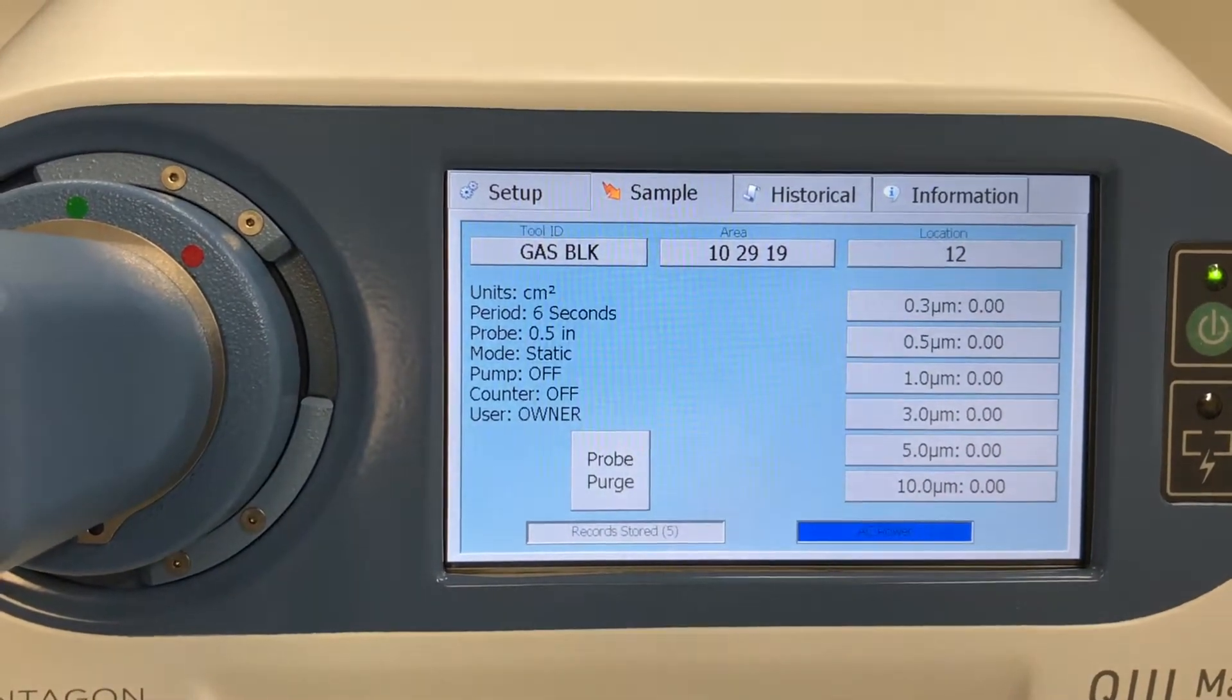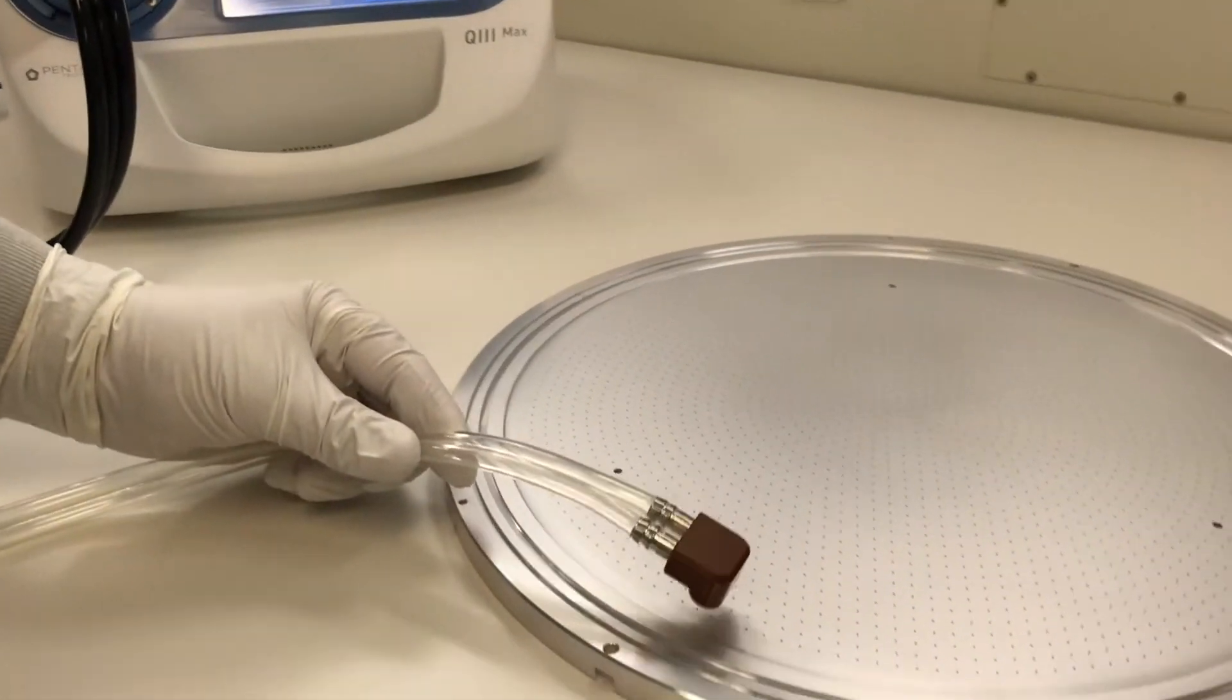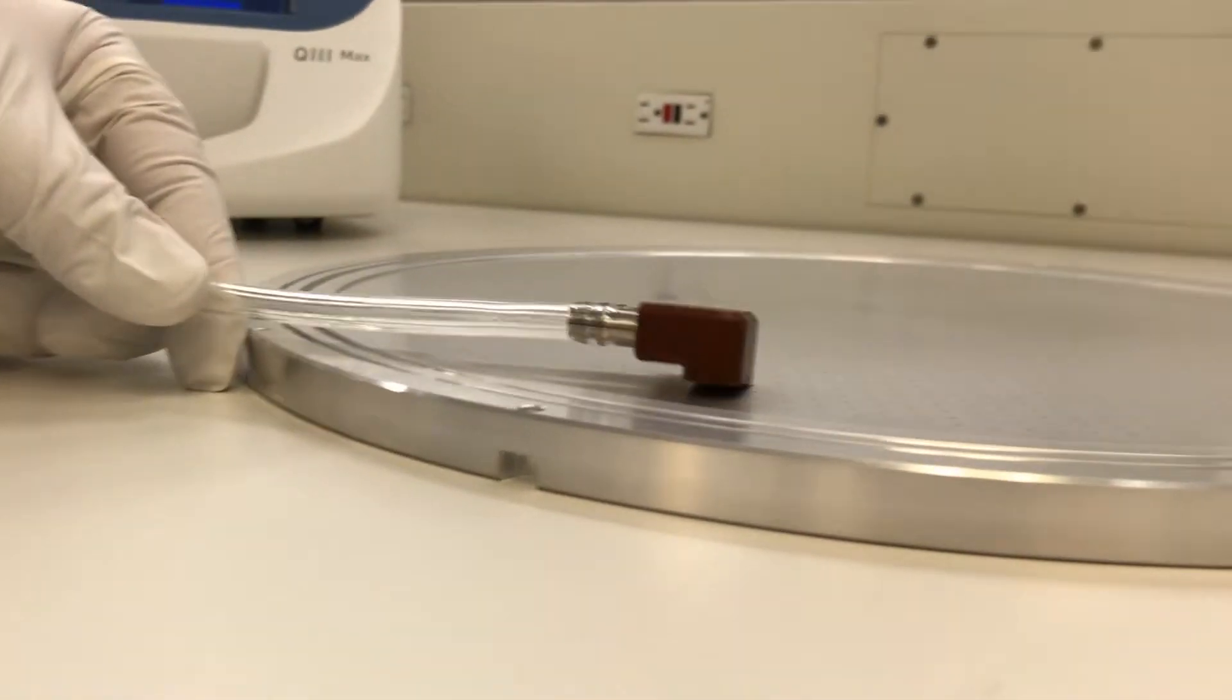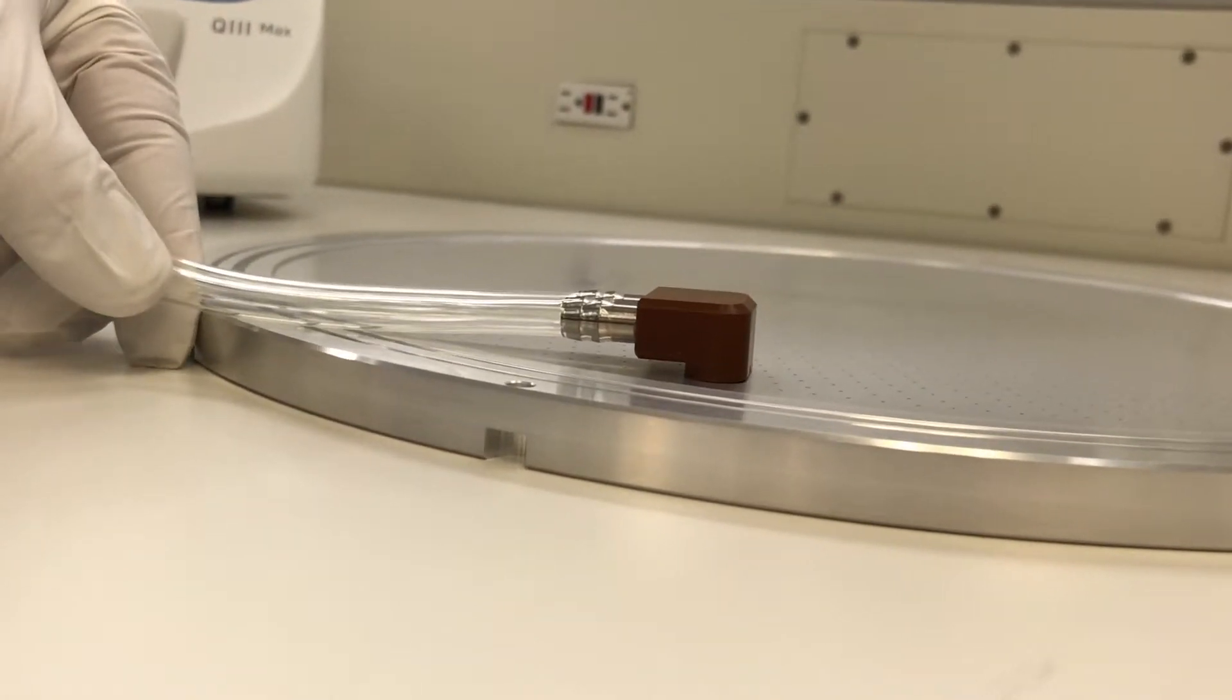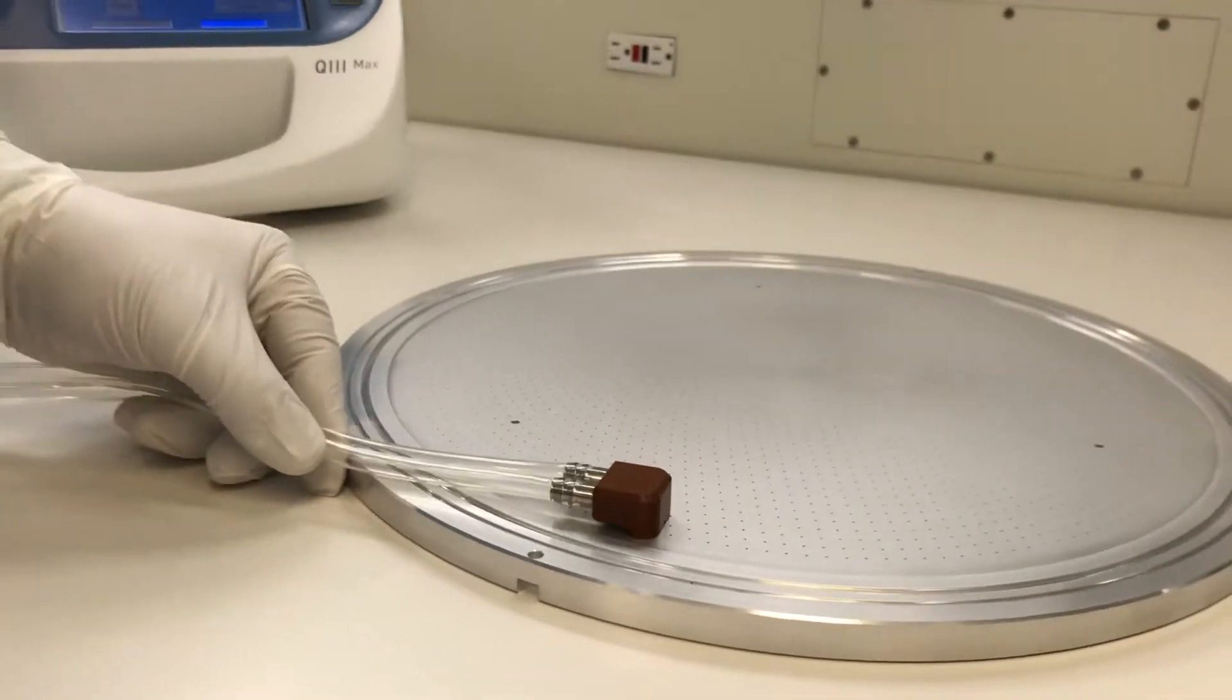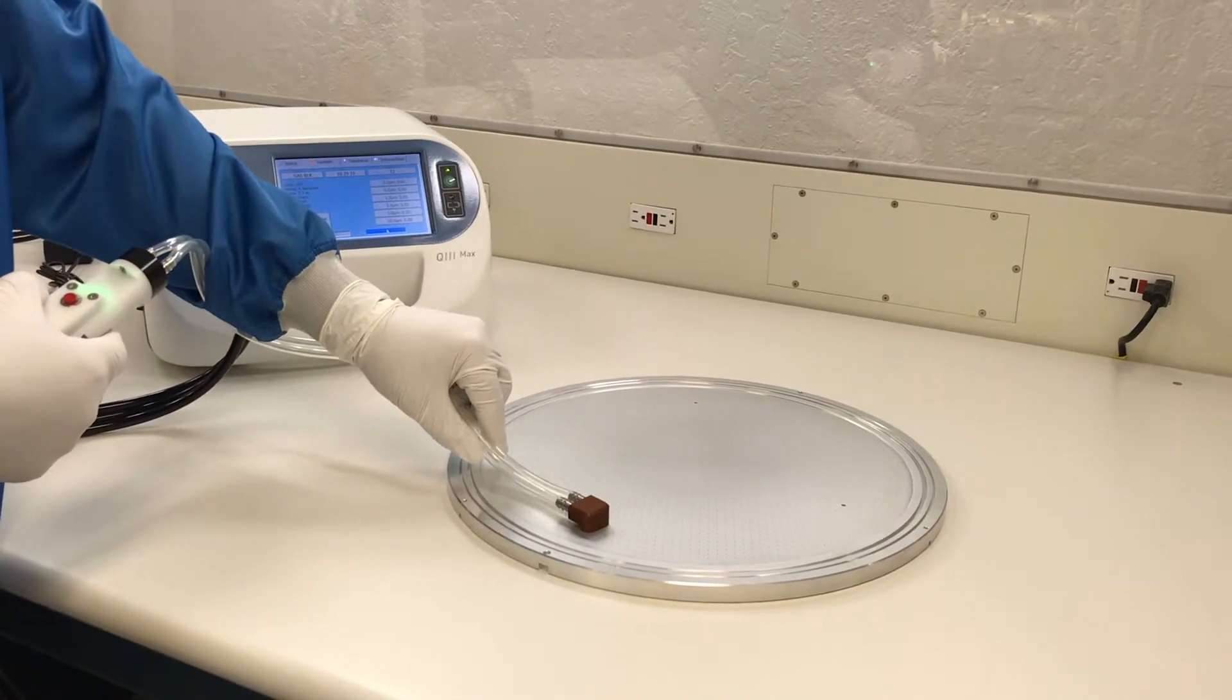To make measurements, place the half-inch probe head flat on the surface while holding the tube back 4 inches or 10 centimeters. Avoid tilting the probe on the surface. Start the test by holding the probe flat on the surface and pressing the red button located on the handle one time. This will start the air vacuum and detection.